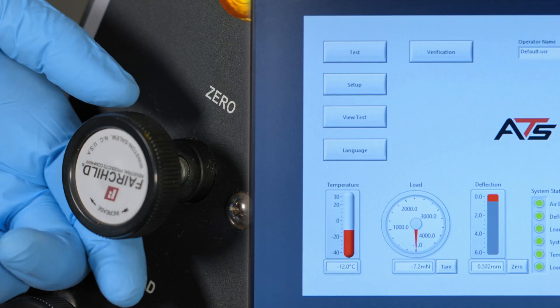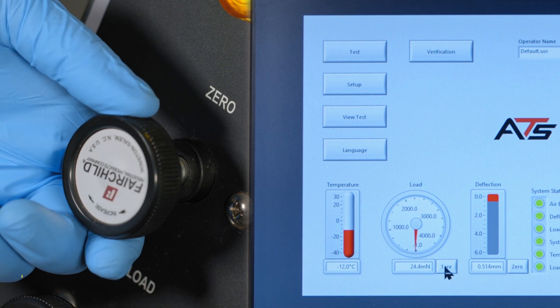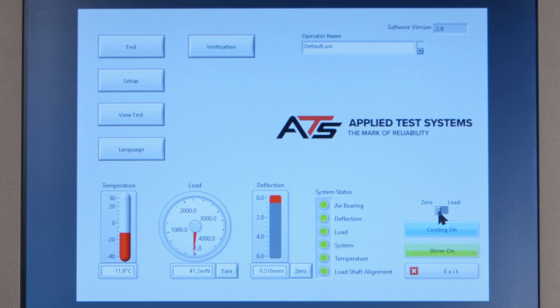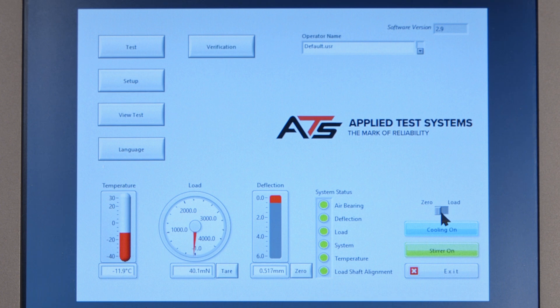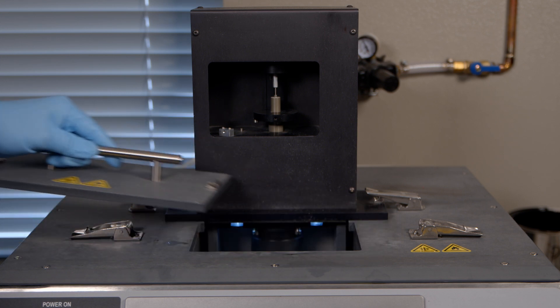Verify the contact and test loads. Place the thick steel beam on the supports. Use the zero regulator to place the load nose just off the surface of the beam and tear the readout. Adjust the load to 35 plus or minus 10 mN using the zero regulator. Switch from the contact load to the test load and adjust the test load to 981 plus or minus 50 mN. Switch between the contact and test loads four times. Observe the loading shaft and platform while switching; there must be no vertical movement. The load shaft must maintain contact with the thick steel beam while switching between loads of 35 plus or minus 10 mN and 980 plus or minus 50 mN respectively. Remove the thick steel beam.